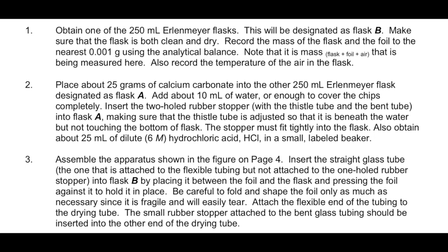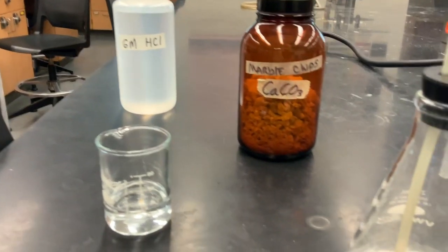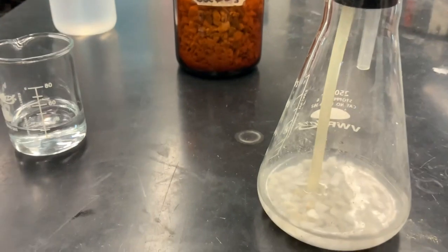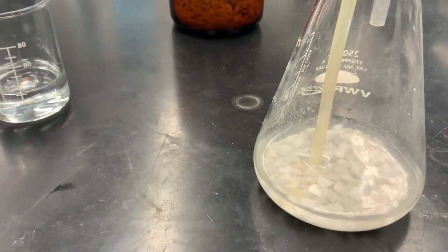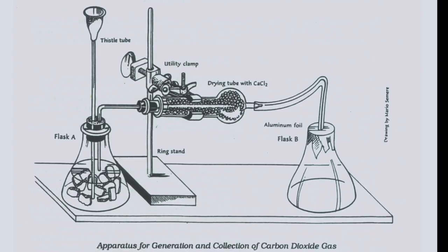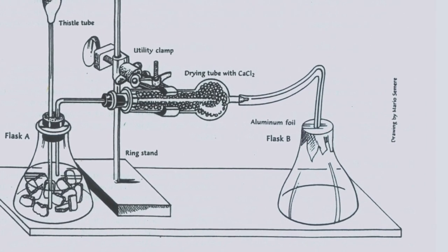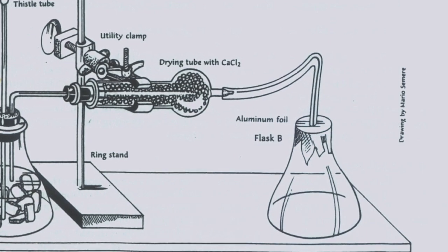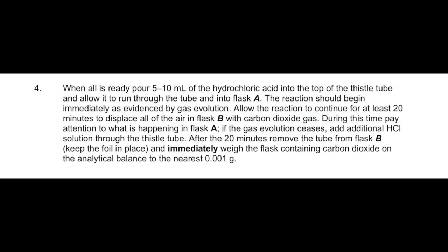Next we will set up flask A by placing a sufficient amount of calcium carbonate — around 25 grams — into the flask along with some water. Then we make sure that the thistle tube is placed properly so that the acid is delivered straight down onto the calcium carbonate chips without any escape of bubbles up into the thistle tube. All of the gas will exit out of the tube on the right side, go through the drying tube where moisture will be removed, and then be collected inside flask B, pushing out the air that was in the flask to begin with.